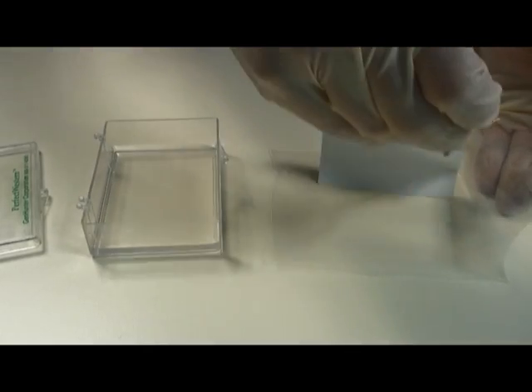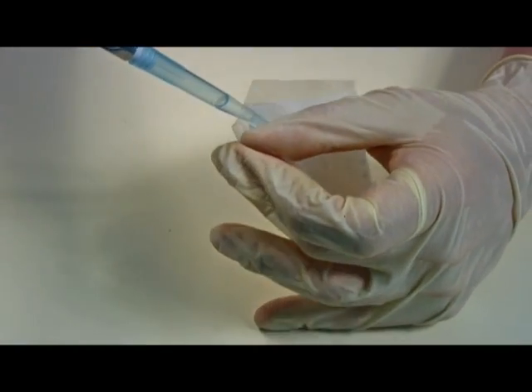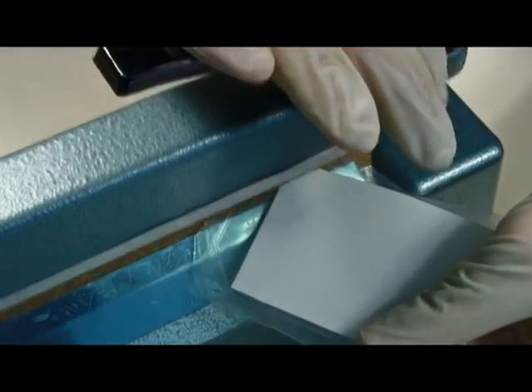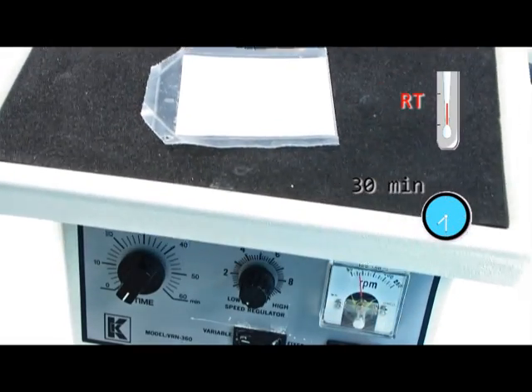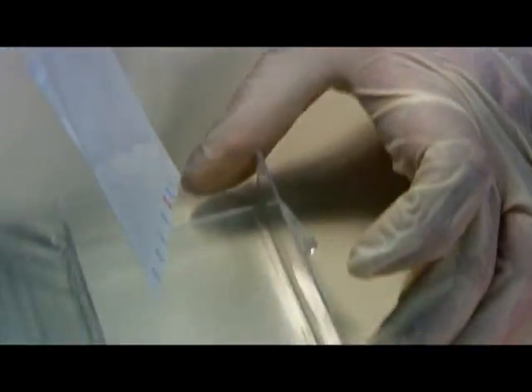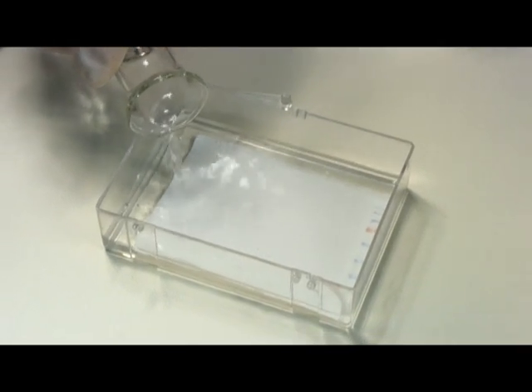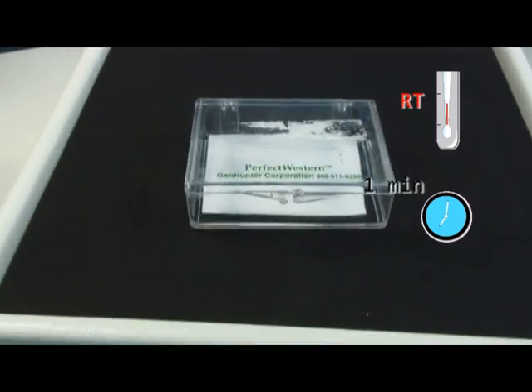Place the membrane in a new plastic bag. Seal it. Through a hole, add the secondary antibody with P1000. Seal the bag and incubate under the same conditions for 30 minutes. After cutting the bag and discarding the contents, place the membrane in a container and wash it in washing solution. As before, wash 3 times, 1 minute each.